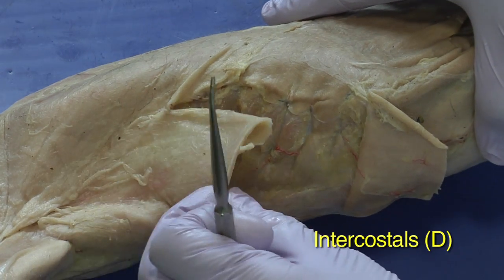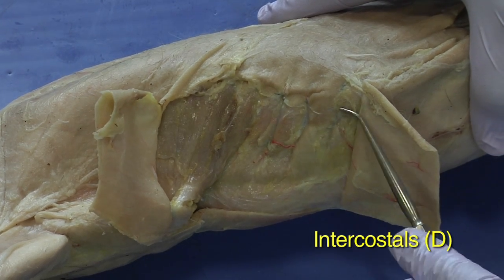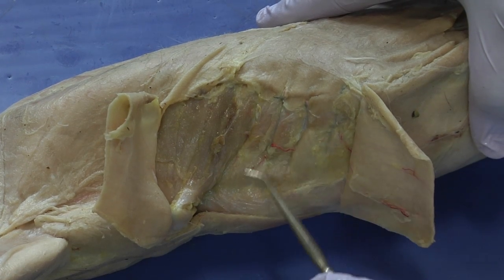These are the muscles along the rib that are really important in breathing. And ordinarily, there's a lot of fat — you can see this yellowing, that's adipose tissue.